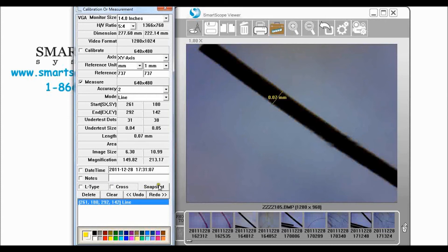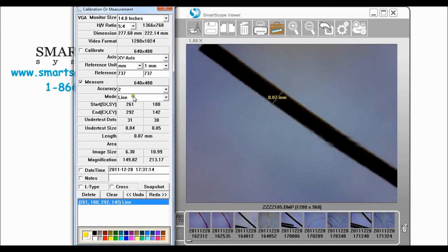And I want to go ahead and take a snapshot by clicking that button right there. So I've taken a snapshot of that image, I've taken a picture of a cow hair and we want to compare that to rabbit hair.